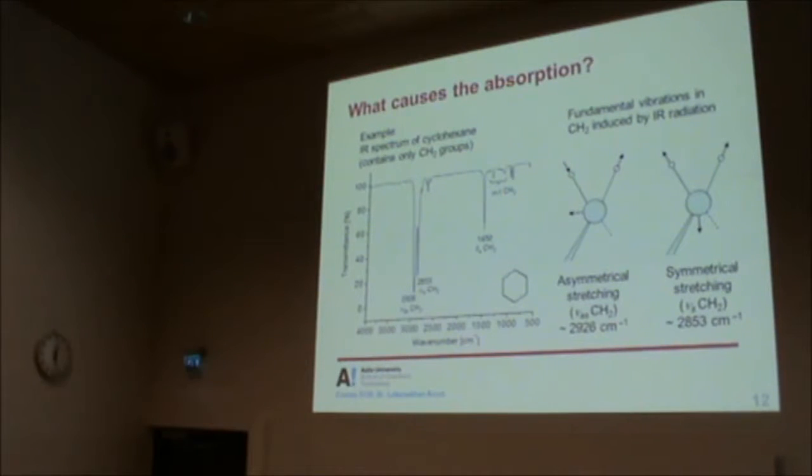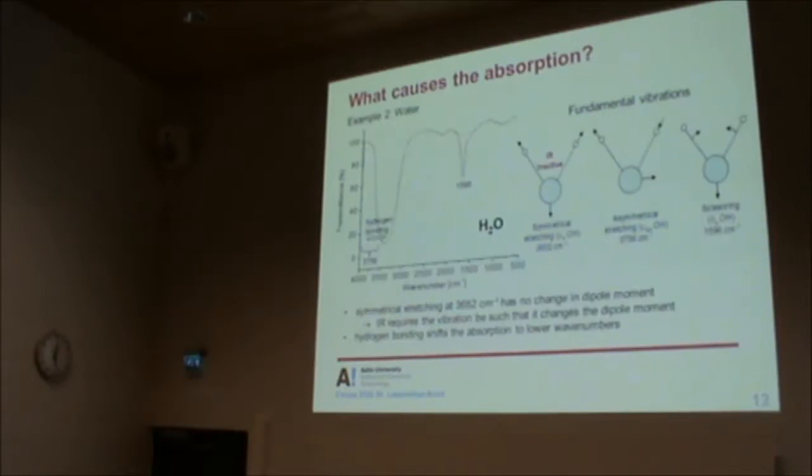Maybe that is of higher intensity in Raman. Okay, I mentioned that. So you have peaks that correspond to vibrational modes of bonds that are in the molecule, and the intensity difference is due to the efficiency with which they interact with the infrared radiation.